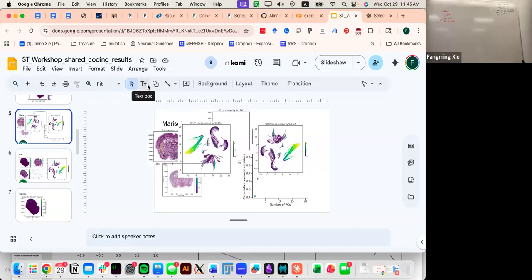So it looks like it's working. So this line should work through in theory, and I don't see a reason why this wouldn't work. Just to make sure, because it's still too much, maybe I also select the first 10 rows, 10 columns, just to make sure it runs.